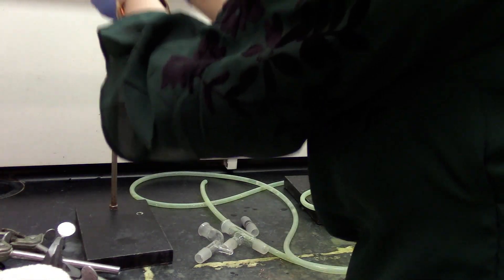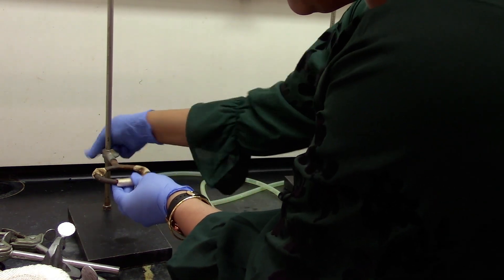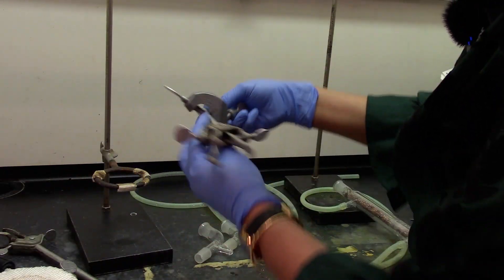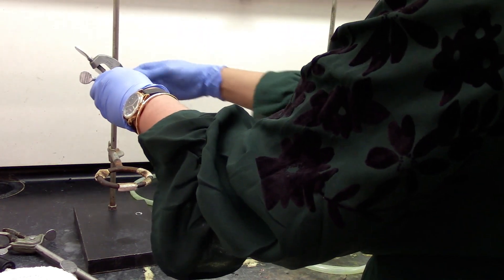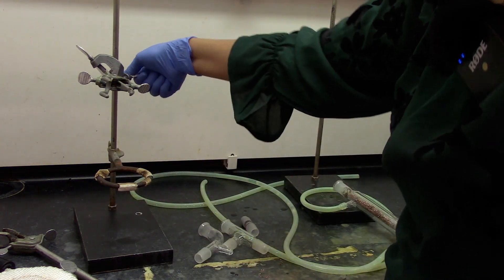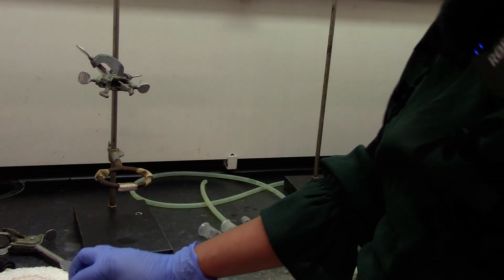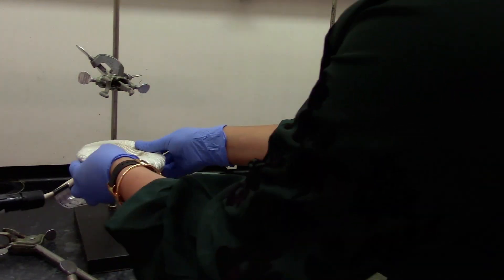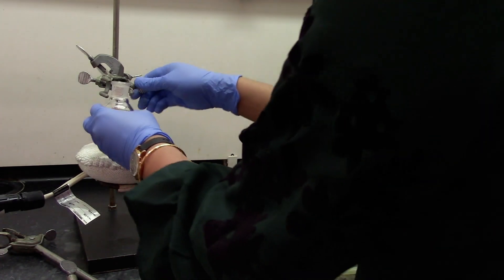Attach a ring clamp onto the ring stand, and a clamp to hold the distillation round bottom flask. Attach a clamp to hold the 50 ml round bottom flask. This is where your mantle will be sitting, and this will be attached right here.